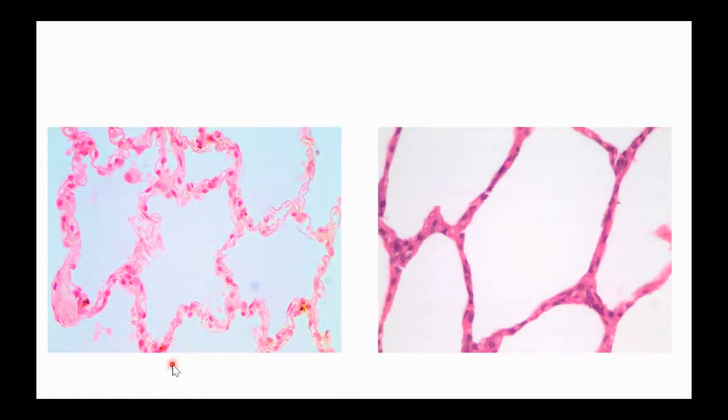The tissue that we are looking at here is simple squamous epithelium. So I've got two different views of simple squamous epithelium here. When we talk about simple squamous epithelium, remind me in the chat, what are the two things that its name tells us about this type of tissue? So we've got simple and squamous. What do those things mean for me? Yeah, so a lot of us are honing in. Squamous means they're flat, right? And simple means there's just one layer. So one layer of squished cells, that's what we're looking at here.